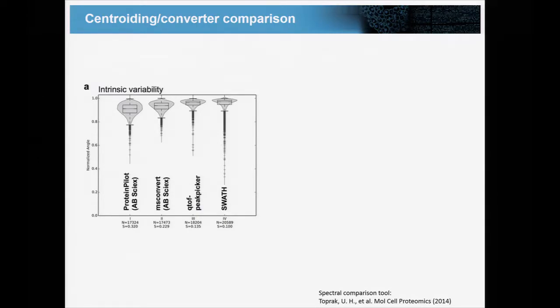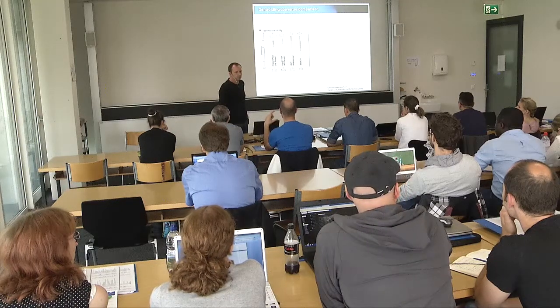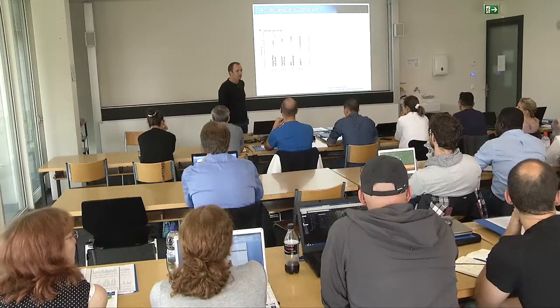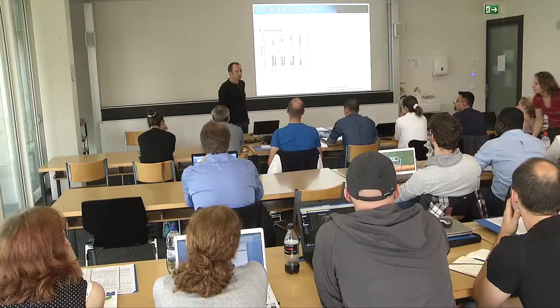Yeah. Sorry, just one quick question to go back to the previous one. So the area that is picked, is it for the whole isotope cluster or for the monoisotopic peak? It's for the monoisotopic, because this is, again, also what we extract when we do the swath analysis. We just take the monoisotopic.